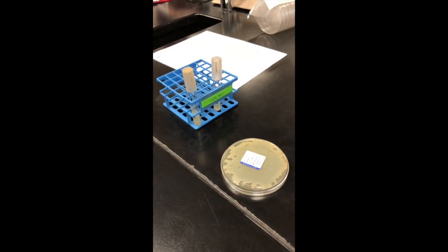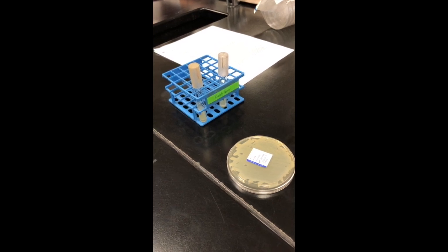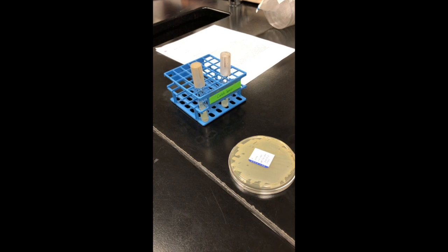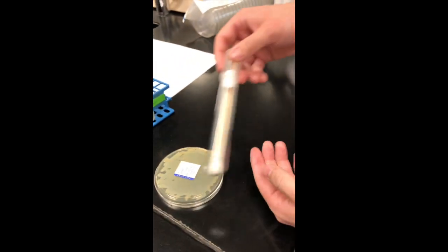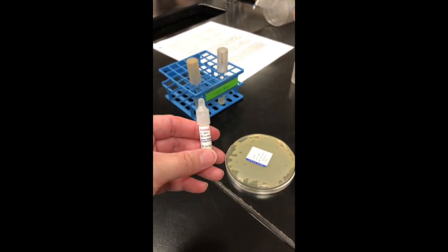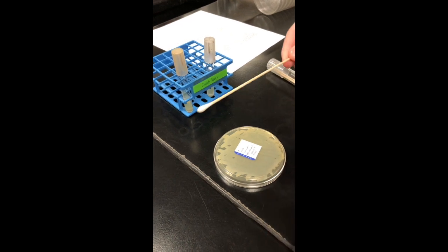Now we're going to do the cytochrome oxidase test. In the cytochrome oxidase test, we're looking to see if our organisms actually have cytochrome C within their electron transport chain. This is very important and allows more hydrogens to be moved across the membrane during oxidative phosphorylation. The way we do this is we have our cotton swabs. We're going to get bacteria on the end of the cotton swab, and then we're going to add a drop of our oxidase reagent. If the cotton swab turns blue, then our organism has cytochrome C.